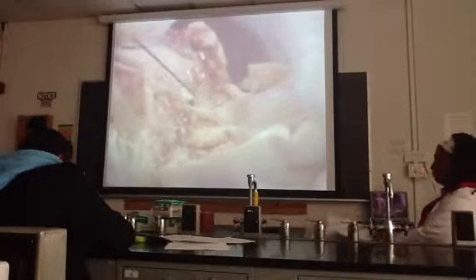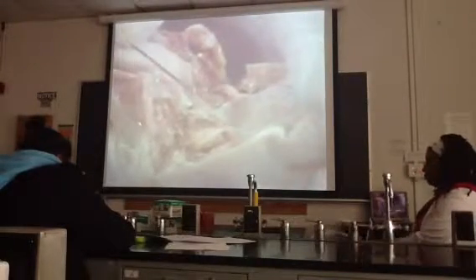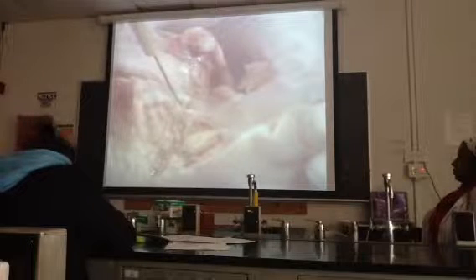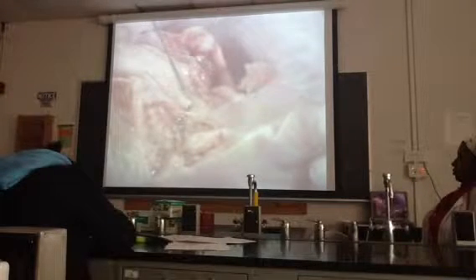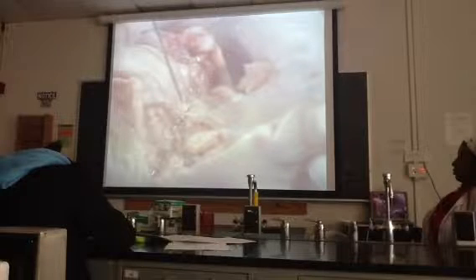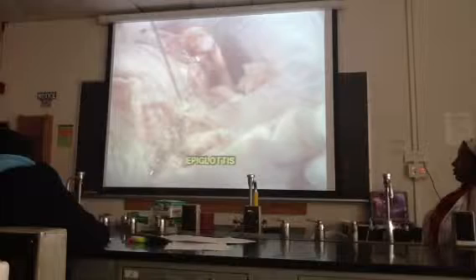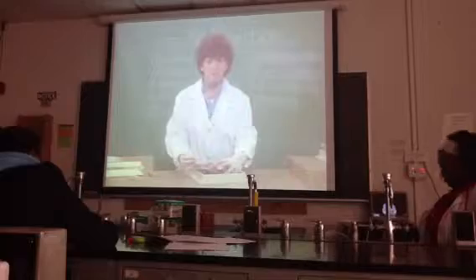If we look down into the throat area, which is also called the pharynx, we can see two openings. One opening leads down to the esophagus, which will go to the stomach carrying food. The other opening, which is called the glottis, leads to the trachea carrying air. Covering the glottis is a flap of cartilage called the epiglottis. This epiglottis will prevent food and liquid from going down into the trachea. In the next section, we will study the urogenital system.